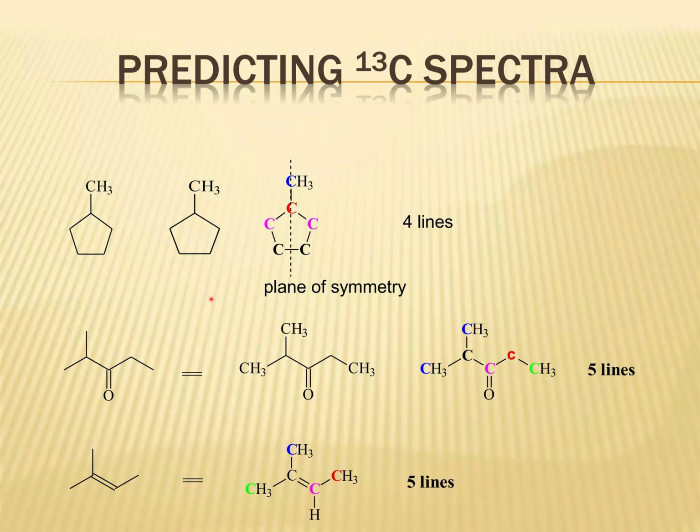Now how will we predict the spectra? So for example, in case of carbon NMR, here you can see one carbon, two carbon, there are six carbons here. So how would we calculate this? Actually, within the six carbons, this and this have the same environment, so this is one environment. These and these will have the same environment, so it is one environment. Here is another carbon, it will have another environment. For four carbon environments, we will have four signals, four peaks.